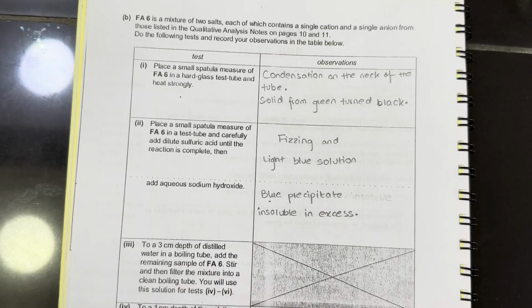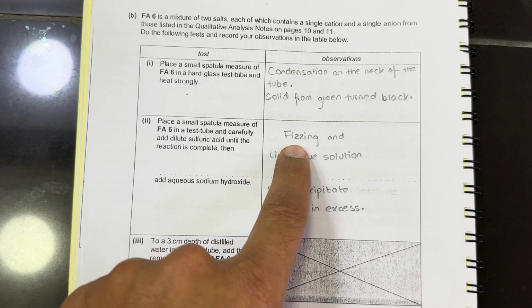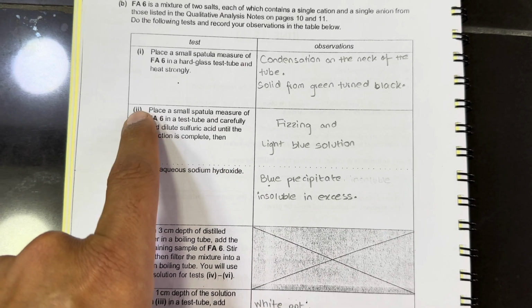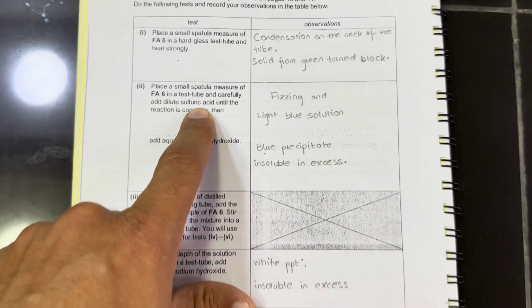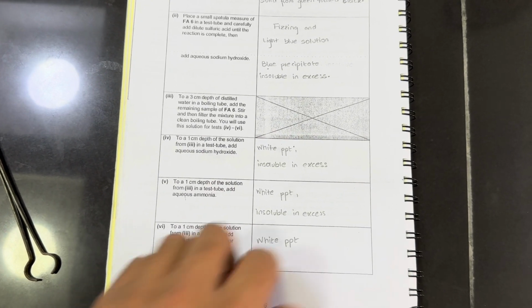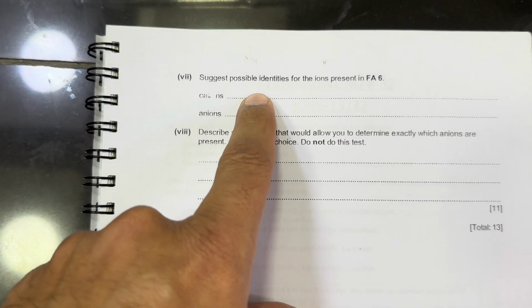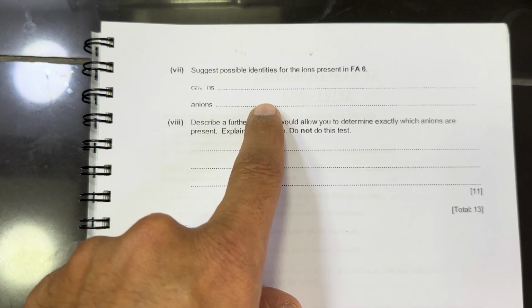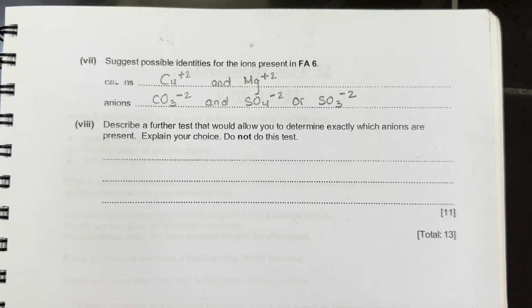Now, again, if we look at this test, they have said Fa6 when added with sulfuric acid and fizzing happened. It means this salt must contain some carbonate because carbonates react with any acid to give you fizzing, that means carbon dioxide. Therefore, two anions detected must be carbonate and sulfate or sulfite. So we will record this here that two cations we have detected are copper 2+ and Mg2+, and anions are carbonate and sulfate or sulfite. So we have recorded all these cations and anions detected.